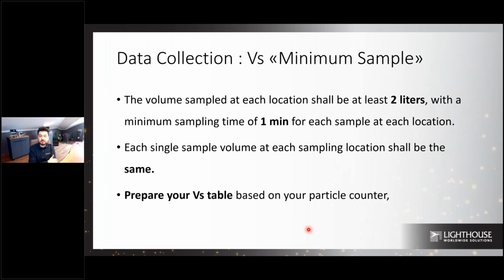This could be 1 CFM, 28.3 liters. This could be 50, 75, or 100. So you don't have to worry about sampling less than 2 liters. Just worry about collecting these minimum sample time of 1 minute.